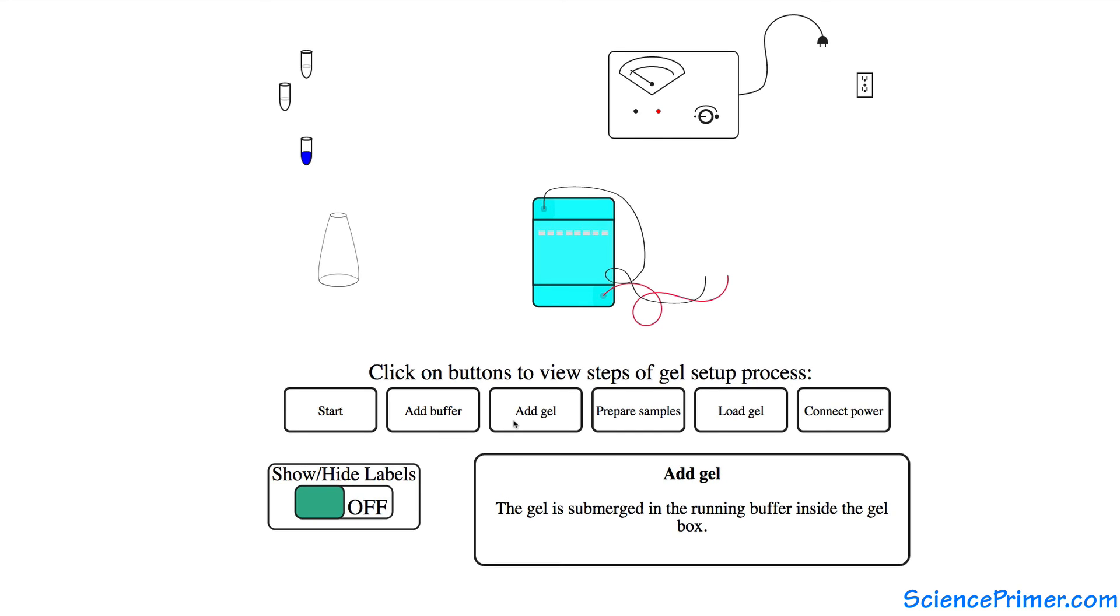Place the gel in the gel box, making sure the gel is completely submerged in the buffer and that the wells are oriented properly. That is closest to the negative, usually black, electrode.